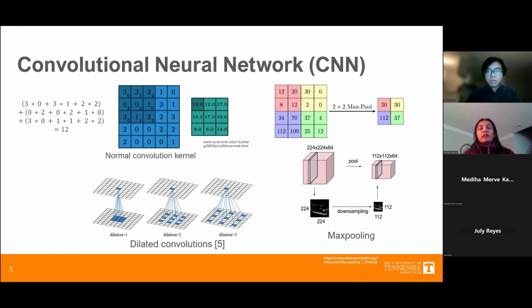you have two kinds of layer, right? One is the convolution layer, and at the end is the layer with the neurons, right? Right. In any network. So one is a convolution and the other is a fully connected layer. So in UNet, we are not using a fully connected layer, right?